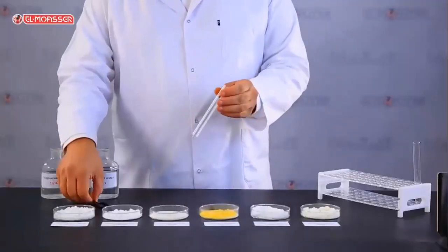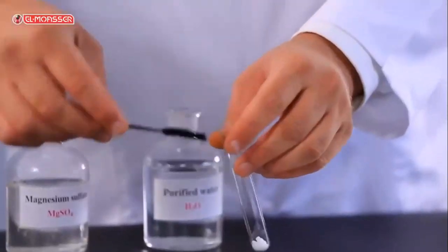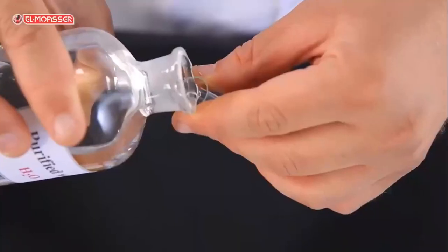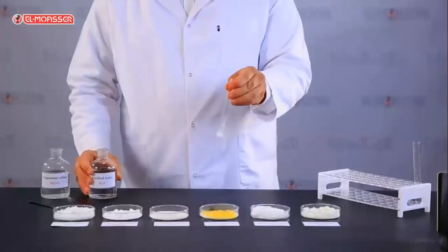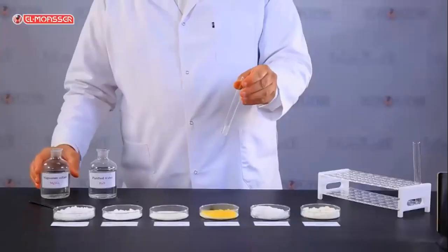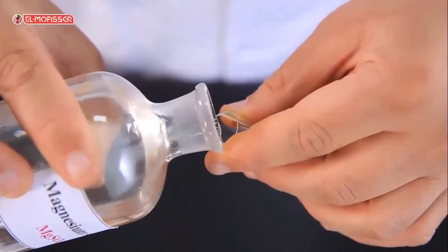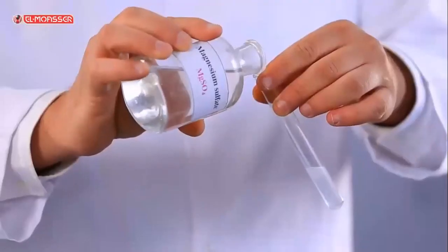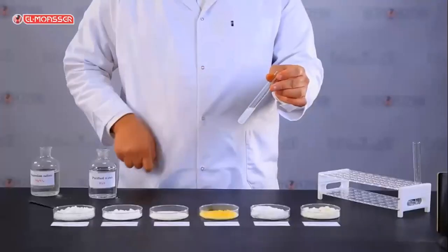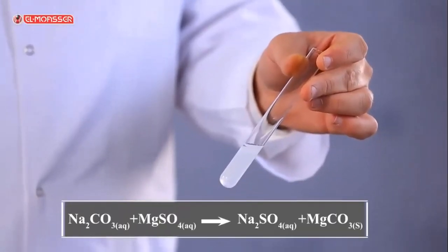Confirmatory experiment. Add a small amount of sodium carbonate salt to a clean test tube, then add distilled water with shaking to form a solution. Then add magnesium sulfate solution to the prepared sodium carbonate solution. What do you observe? A white precipitate of magnesium carbonate is formed in the cold, without heating.